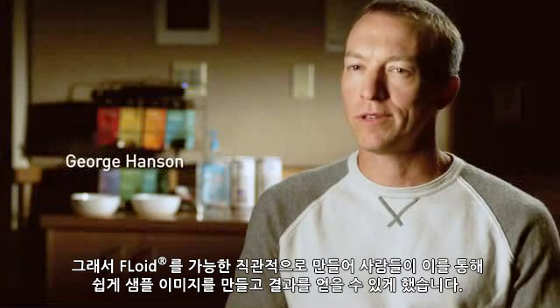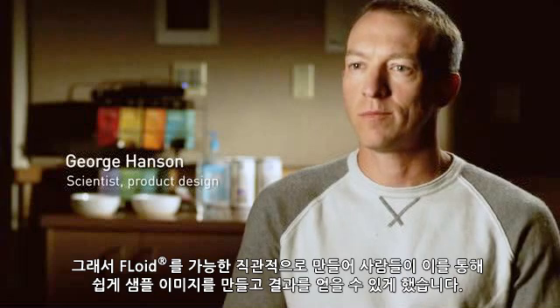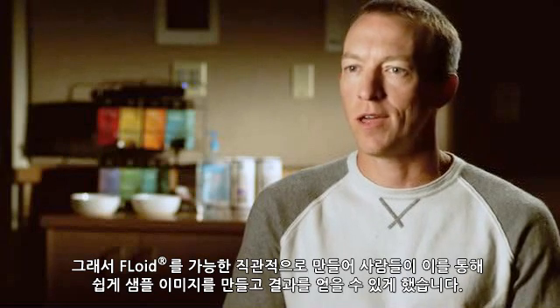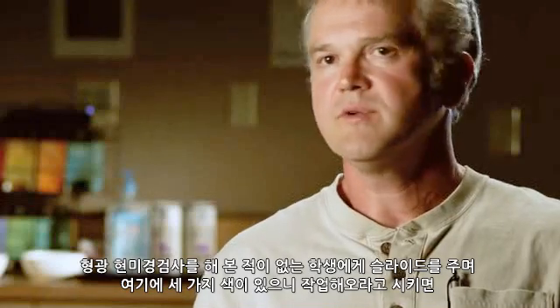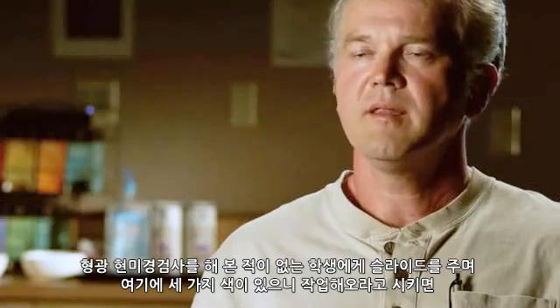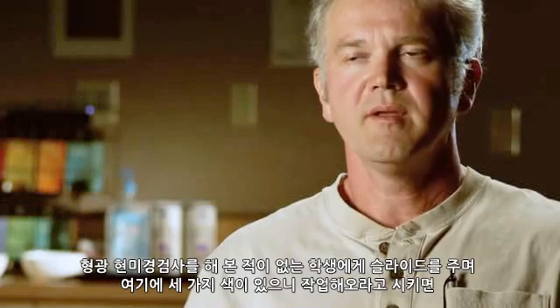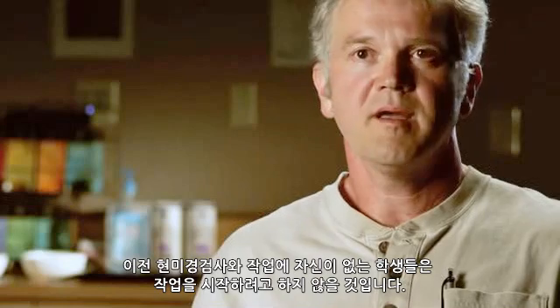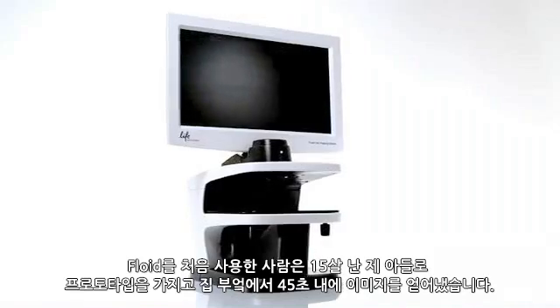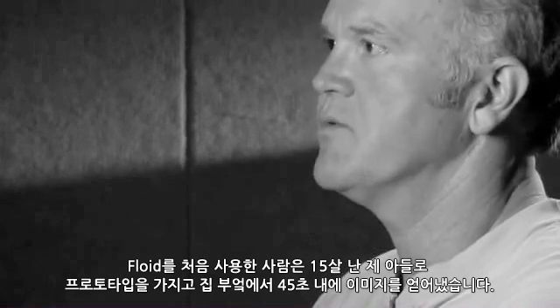We tried to make FLoid as intuitive as possible to allow people to just walk up, image a sample, get a result, and walk away — never having the instrument be a burden. You can take a student who's never done fluorescence microscopy, give them a slide and say there are three colors on here, go at it. They are so intimidated by the old microscopes that they almost don't want to start. The first person to use it was my 15-year-old son at my kitchen table with a prototype, and he had images going within 45 seconds.